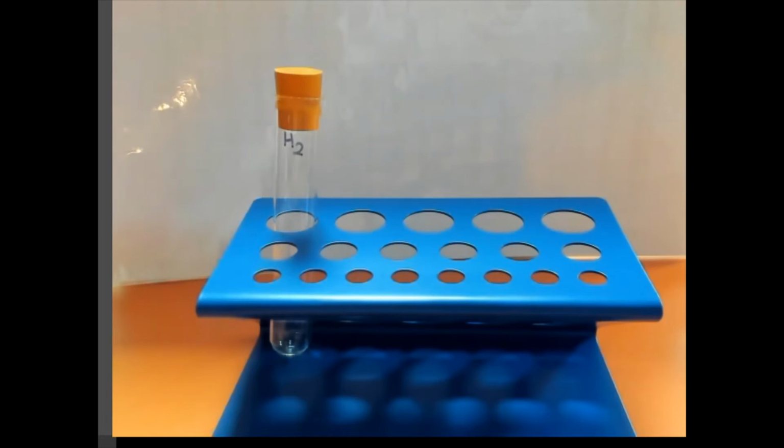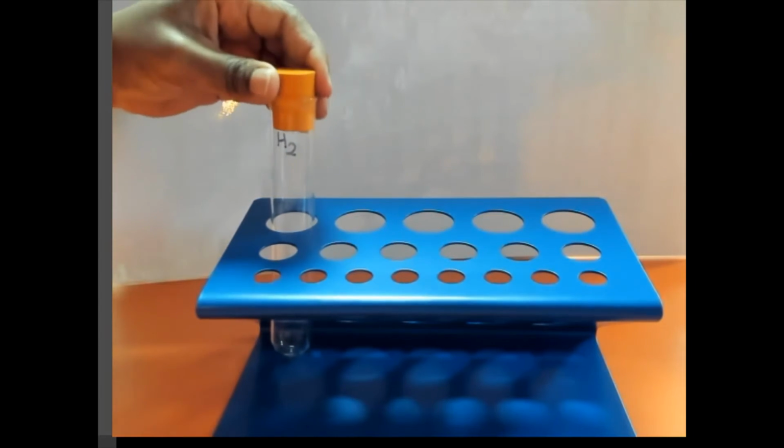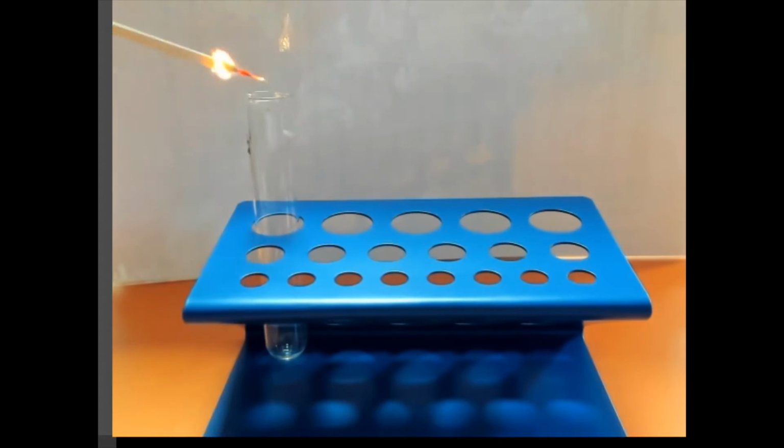In this test tube, I have hydrogen gas. I'll be using a burning splint to test for the presence of the gas. There we go. With hydrogen, we get a pop sound.